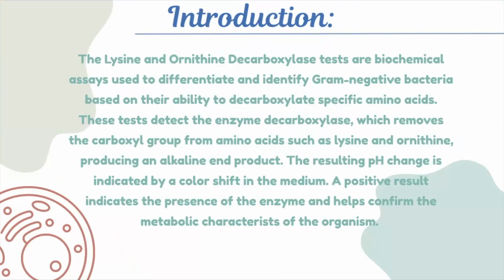These tests detect the enzyme decarboxylase, which removes the carboxyl group from amino acids such as lysine and ornithine, producing an alkaline end product. The resulting pH change is indicated by a color shift in the medium. A positive result indicates the presence of the enzyme and helps confirm the metabolic characteristics of the organism.